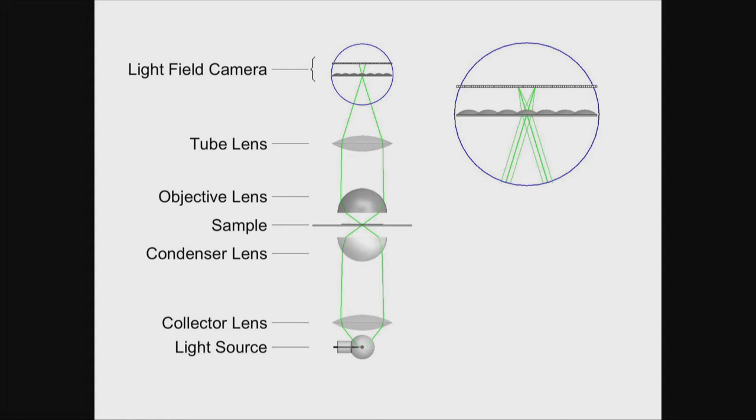I like to think of it as you sort the rays differently, and there's no free lunch in a way: you do give up some lateral resolution, and especially in microscopy, you don't really like to do that. So this technique, while it has been available since 2008 or so, hasn't made much impact in microscopy because of its focus on high resolution, on super resolution.